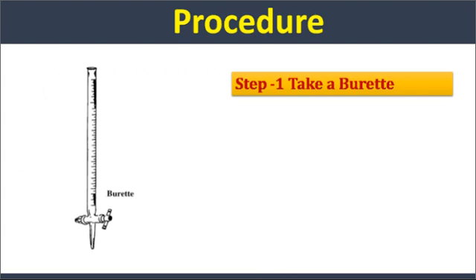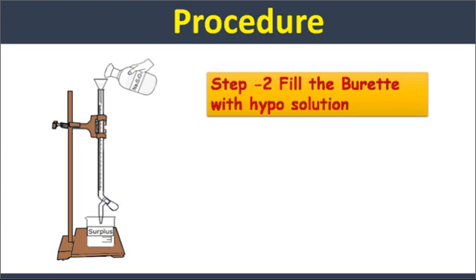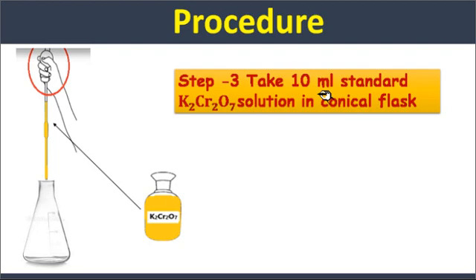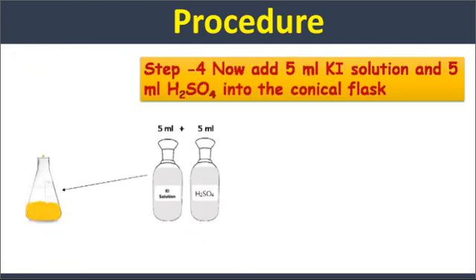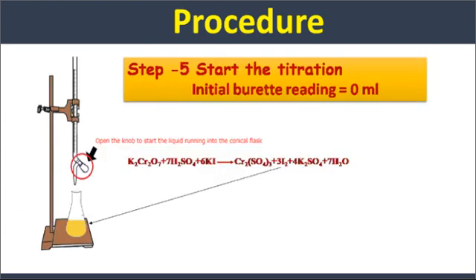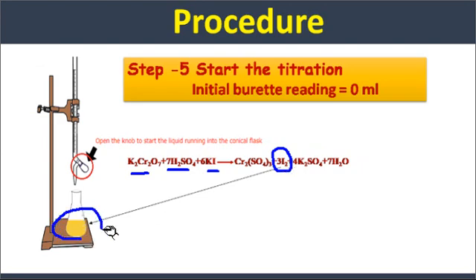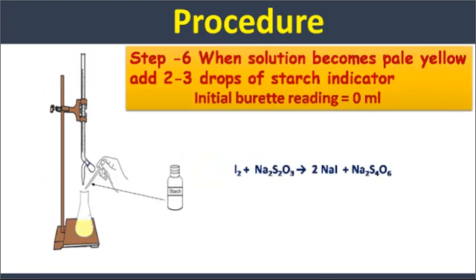First step: take a burette and fill it with hypo solution. Take a conical flask and add 10 ml of standard potassium dichromate solution using a pipette. Now add 5 ml of potassium iodide and 5 ml of H₂SO₄ to the dichromate solution. H₂SO₄ provides the acidic medium while potassium iodide provides the iodine. The dichromate reacts with KI and liberates iodine, turning the solution brown.